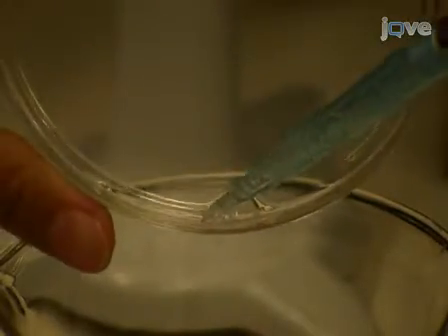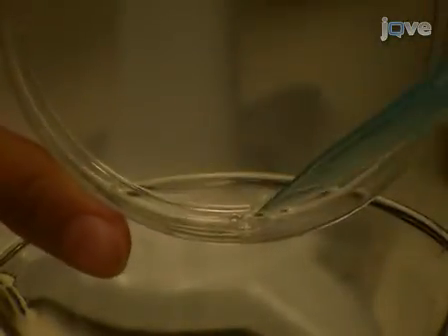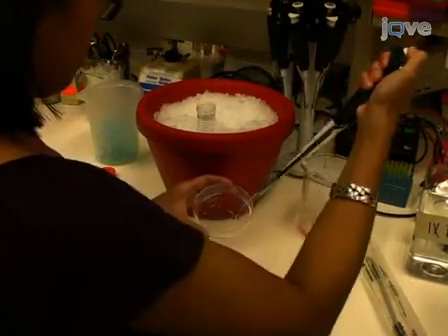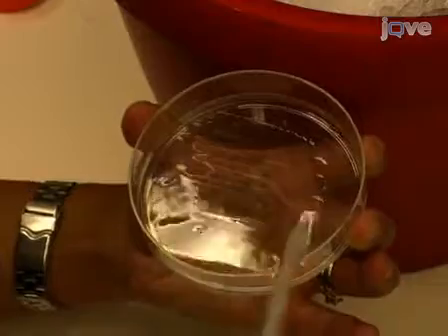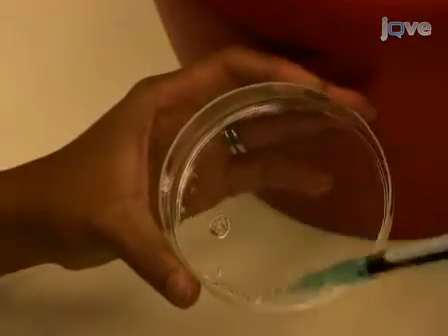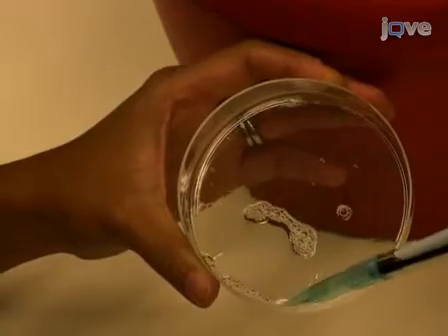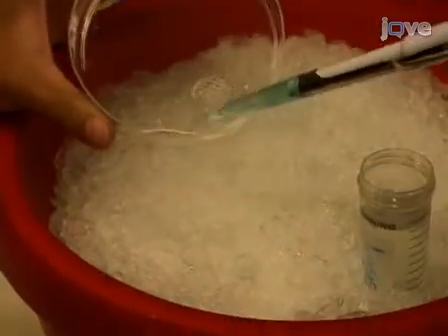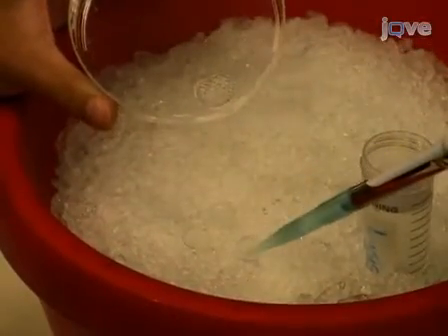Pipette away any residual PBS from the tissue culture dish. Add 1.4 mL of cold lysis buffer and harvest cells with a cell scraper. Quickly transfer half of the lysate to each of 2 1.5 mL microfuge tubes on ice.